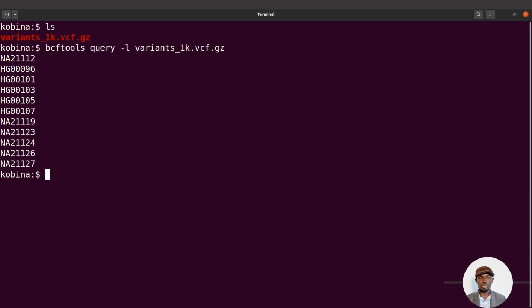I want you to watch this video to the end because I'll give an important detail towards the end of this video. So just make sure to watch till the end. It's very important because sometimes we forget to include that when we are doing the splitting or subsetting. I'll let you know that later on.